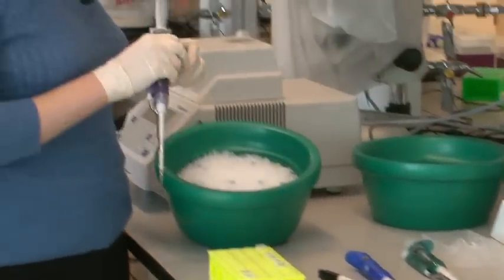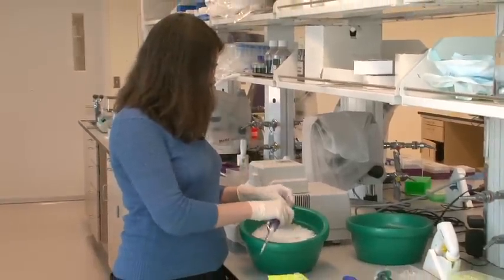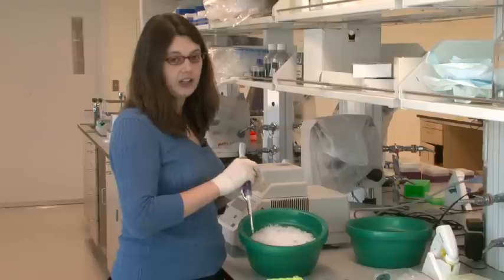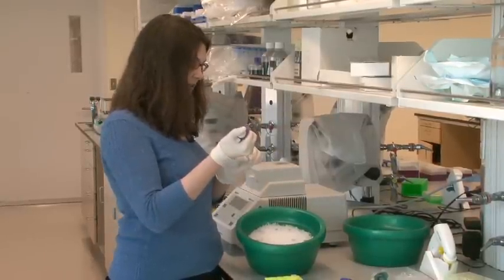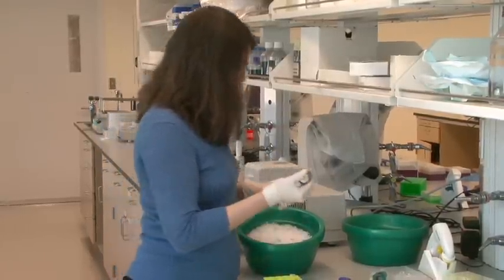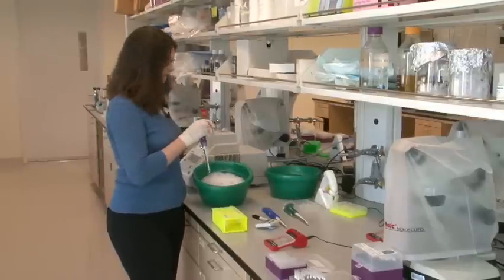The next thing I'm going to do is add the reagents or chemicals that I'll be needing for each copying reaction to each one of the tubes. This includes all of the necessary chemicals that take you from having a small amount of DNA to copying it into a large amount of DNA.